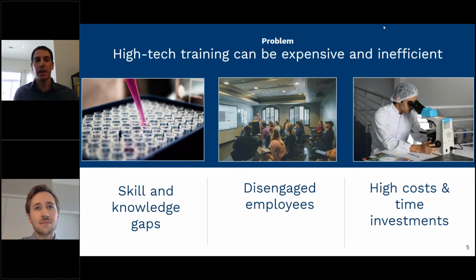And then hopefully you also have an opportunity to inculcate this sense of the importance of lab safety and best practices. You may be working with more junior level employees, or maybe even senior level employees, but they get a little bit sloppy here and there. Is there an opportunity to actually imprint on them the importance of some of these practices? And of course, there's also often a legal or compliance-based need, whether it's OSHA or CAP or some other organization, to meet an annual safety compliance, or when someone first onboards with your company or with your lab, what kind of training are you doing for them? So it's really important for all these reasons.